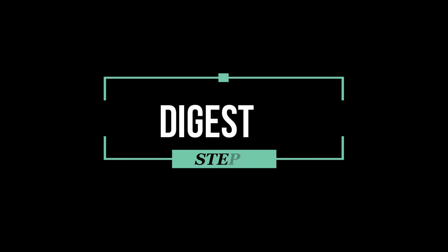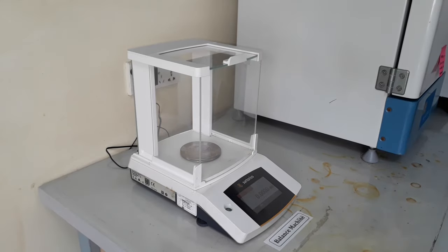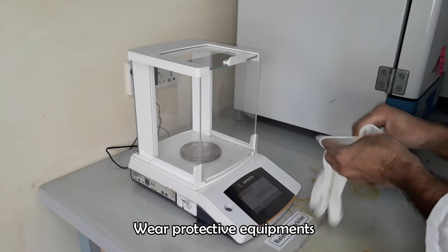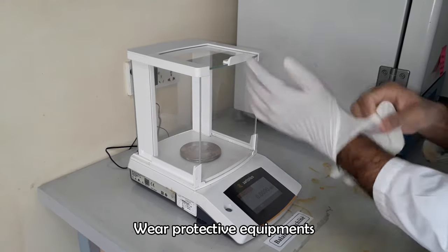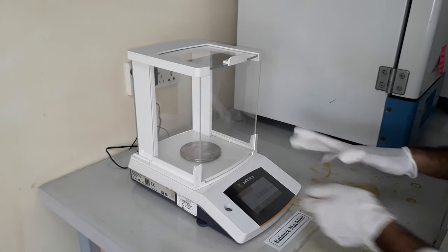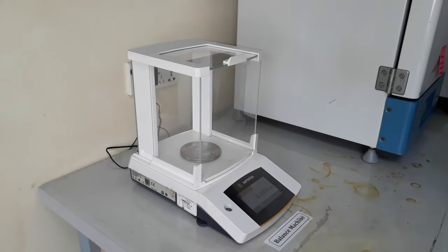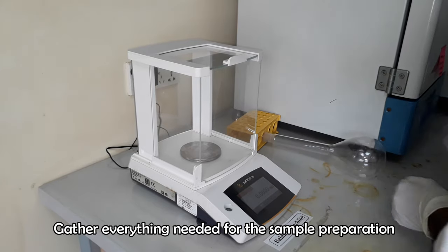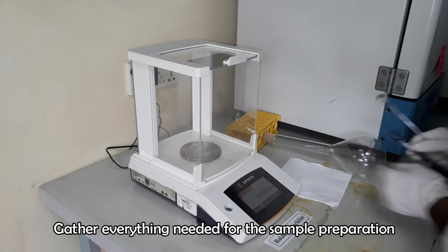So let's do the protein analysis. First of all we need to digest the sample by concentrated sulfuric acid in the presence of catalyst and heat. Wear protective gloves and mask. Use acid-proof gloves where necessary. Gather everything you need to prepare the sample before going for the digestion.